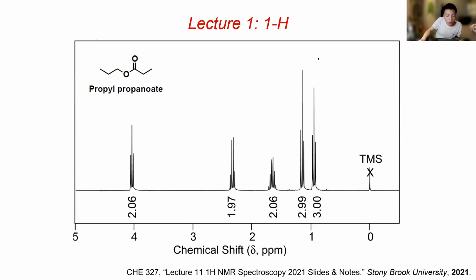And I will let you guys work through this. Can anyone tell me which hydrogen this one should correspond to? Yep, it's this one. And it's a triplet.